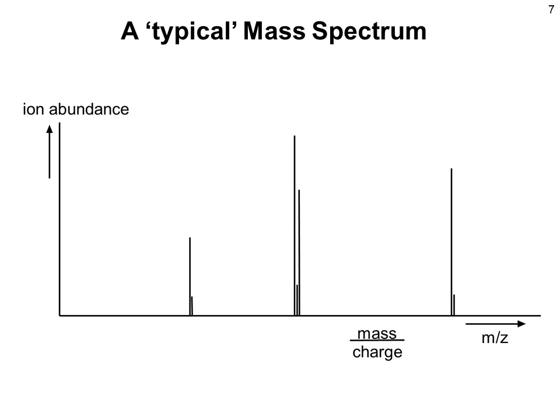Interestingly, at each part we see a cluster of peaks. Two peaks on the right, three peaks in the middle, and two peaks on the left. These multiple peaks, which we will come back to, are due to the occurrence of isotopes in nature. Most likely these additional peaks are due to the occurrence of carbon-13, it's about 1.1%, and in the middle we might hypothesize that another heteroatom is in this molecule, for example bromine, but we do not know this yet. So if you look at a mass spectrum like this, you cannot immediately and easily interpret it. You need to have some knowledge and you need to have some software.